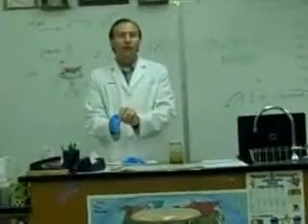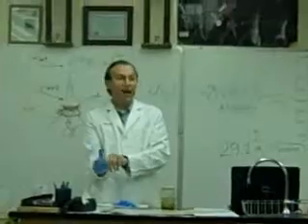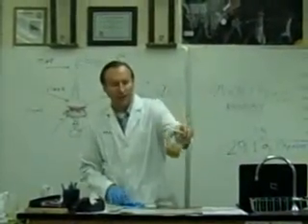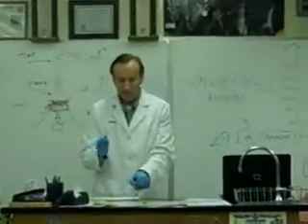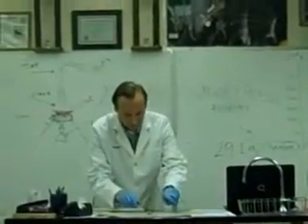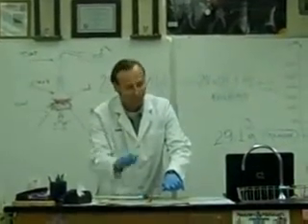Remember one of the properties of metals in general? In appearance, are they shiny or are they dull? Shiny. This is not shiny. What is going on? Can somebody explain it? It's dirty. Can you cut it? We cut metal. Yeah, metals are soft. Oh yes, this is group 1.